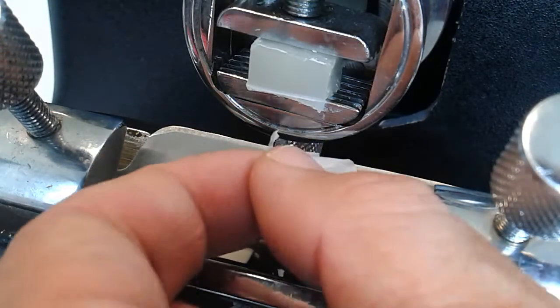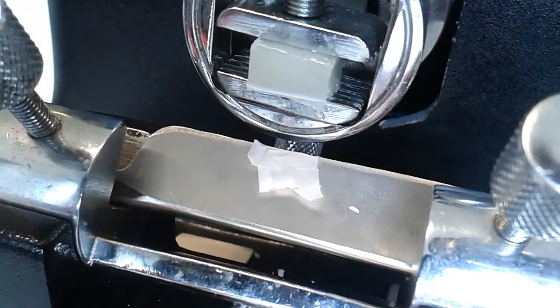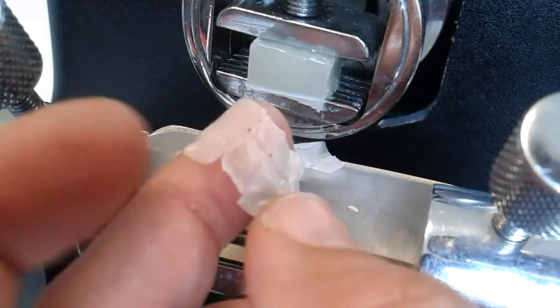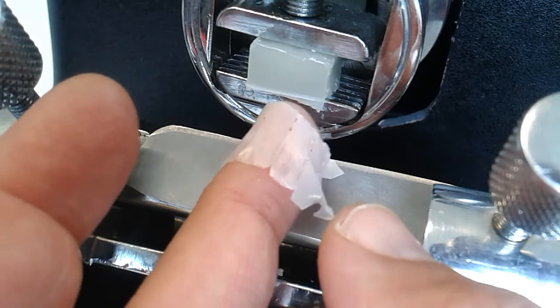You have to carefully remove this and usually use some kind of a solvent like xylene to remove the wax. Then you have the pure specimen left over, which you can then observe under the microscope.